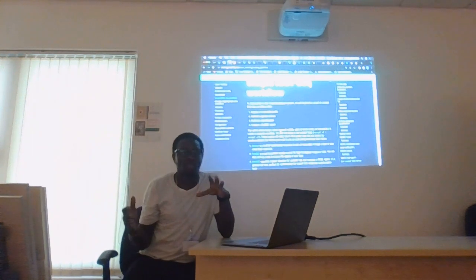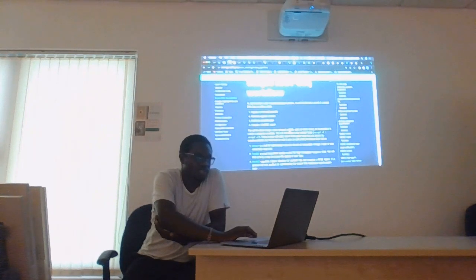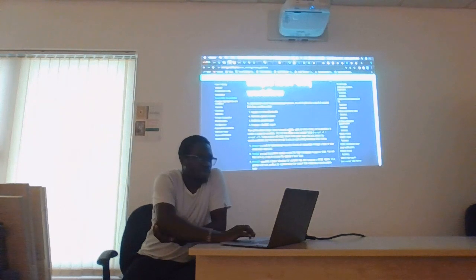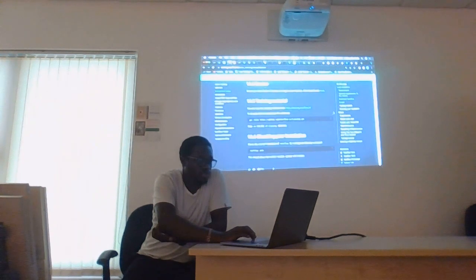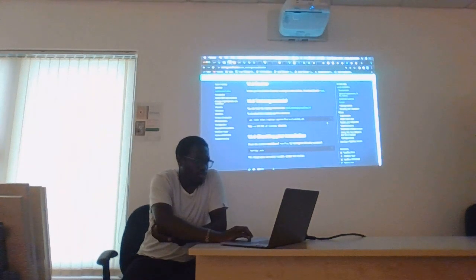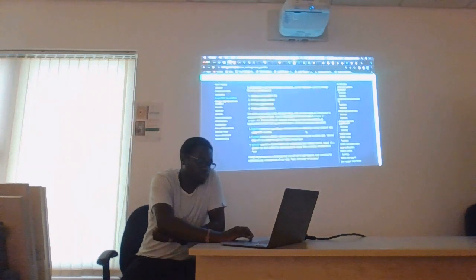So the first thing we did was to do it on our machines, either on HPC or on our computers. So we were cloning the training repository into a local machine using this command. So once we did that, we were in a position to proceed with the rest of the workflow.